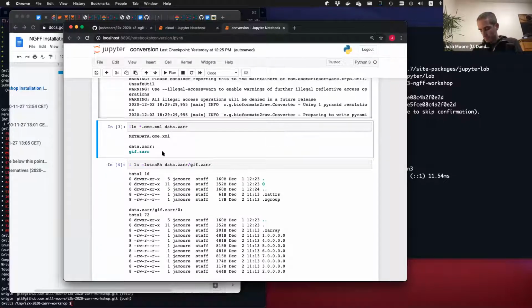So this backs up a second to how bioformats works. Bioformats, actually the OME standard, lets you have multiple images in any file set. Sorry, I'm getting pinged on Slack. That means, let's say you have a CZI file or something, or even a TIFF, that can have many individual multi-dimensional images in it. In bioformats world, those are called series, right? So you can have in one file set, tens of thousands of images if necessary.